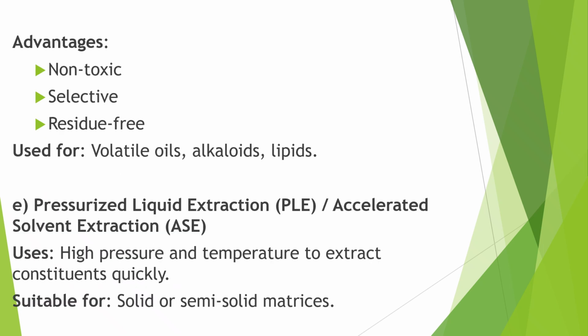The advantages for the process are that it is non-toxic, very much selective and residue free. For volatile-containing, alkaloid-containing or lipid-containing drugs, we can easily use it, or it is very much helpful for such kinds of drugs in the extraction process.